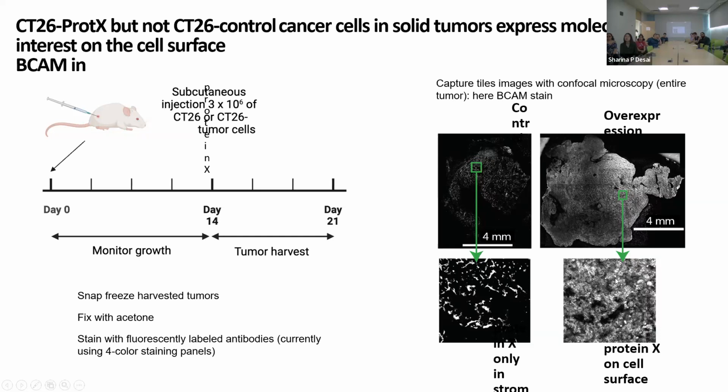The limiting factor is really, the tiling is incorporated in the software, so even if you just read the manual, you can do it. From a practical perspective, the biggest issue is that it is a bit hard to put the whole thing together, because you have to go one tile here, one tile there. And, as I said, the autofocus, I don't know, it's just not working. But well, anyway, it works, but it's slow, and I don't know what they do differently.